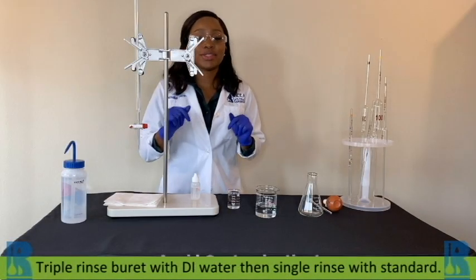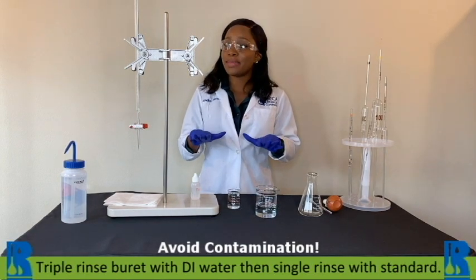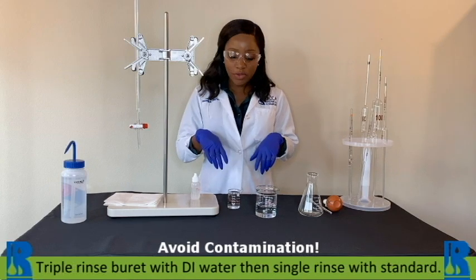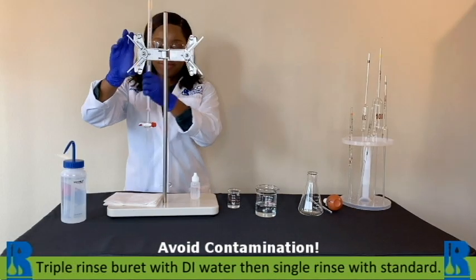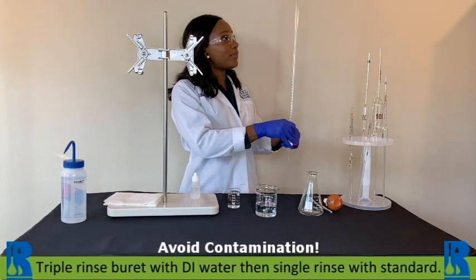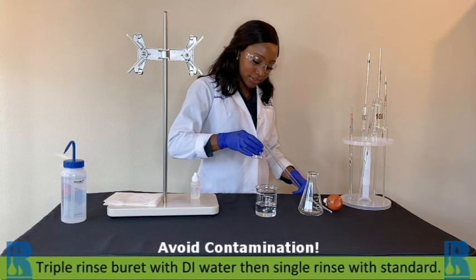Start by triple rinsing your burette — that will allow you to remove any possible contaminants. You want to rinse with DI water. You can also follow up with a rinse using your standard. Go ahead and fill the burette with the standard, and remember that's the one normal sulfuric acid.